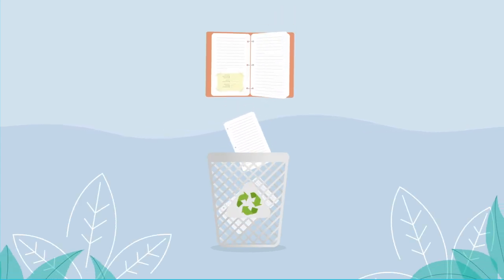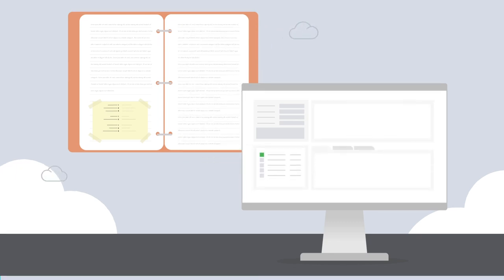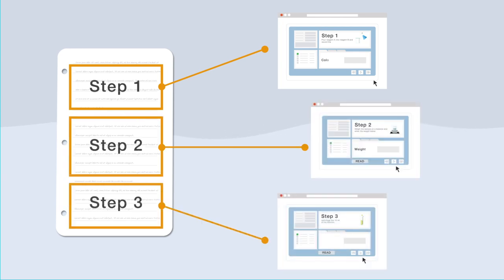Thermo Scientific SampleManager's lab execution system allows you to make your lab more paper-free, lets you break down complex procedures so they are easier to understand, and records information far more accurately because it is only entered once, ensuring compliance and data integrity.